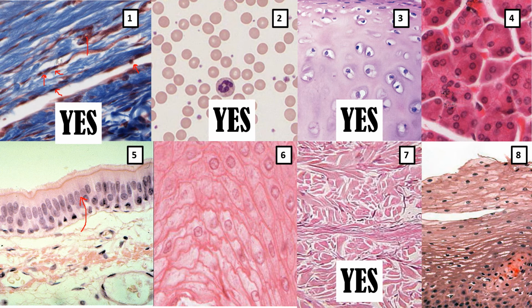Second clue is we see these protein fibers here. They look kind of like swirls again. Okay, I think it looks like seaweed in the ocean, but when you see something like this, you should think protein fibers. Third thing is there's again lots of ECM around. So this is a connective tissue.